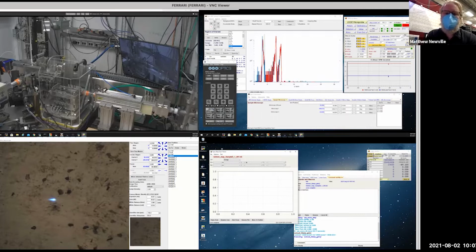We really try to focus on doing micro XANES and XAFS, so we've optimized our beamline for that. And since we're funded by NSF and a little bit of money from the Department of Energy to do geosciences, we really focus on Earth and environmental science. A lot of our work is actually deep Earth geochemistry. So how much oxygen is in the deep Earth or in other planets. So we're often studying lavas, basalts, glasses from deep Earth, or samples returned from NASA missions and similar.